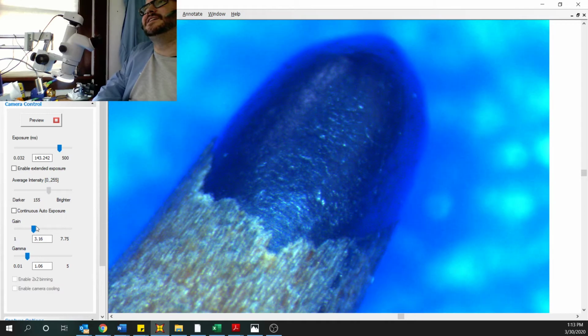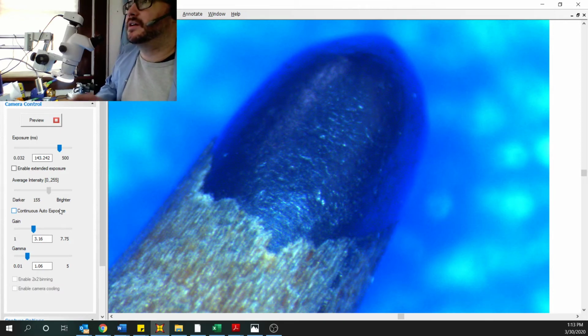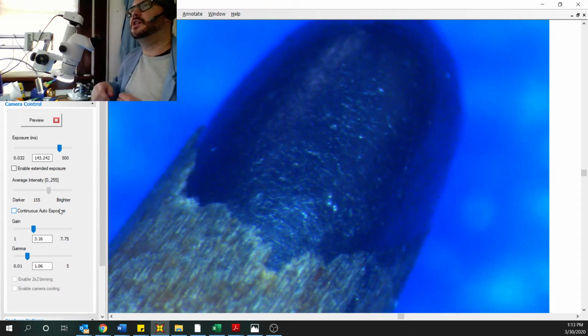You see that? There's like little shavings on there, like little tiny, almost like scales. What do you all think of this? Isn't that kind of neat? Did you expect something at that level? We can go in just a little bit closer, actually.